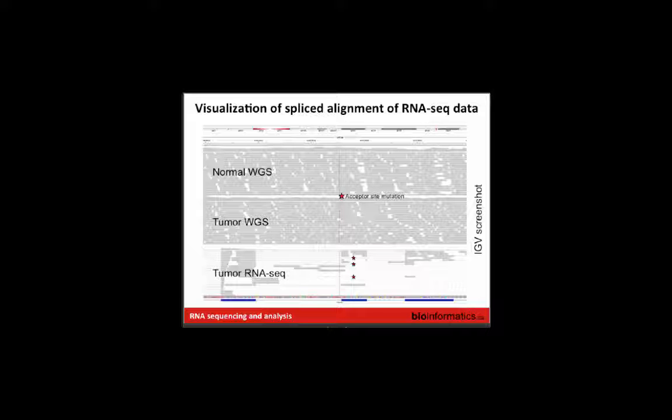Could actually be real transcription. Basically like an alternative isoform that has a different exon-intron boundary is another possibility. Anything else? Non-coding. Could be another transcript that just happens to be transcribed there, possibly on the other strand. So this is unstranded data, so we don't actually know what strand each of these reads correspond to. So it could be that these reads here are aligning to this transcript going in that direction, and there is an antisense RNA that's transcribed in the other direction. We're seeing some signal from that, perhaps. Another possibility is genomic DNA contamination that's made it all the way through, that wasn't effectively removed by the various steps upstream that attempt to remove it.